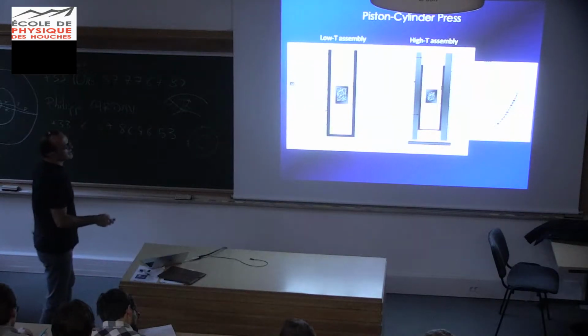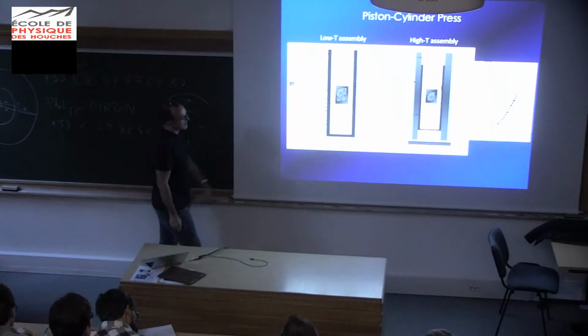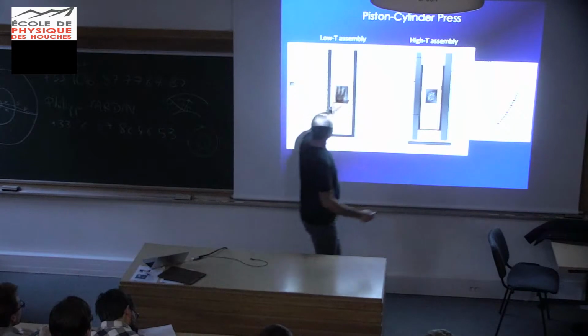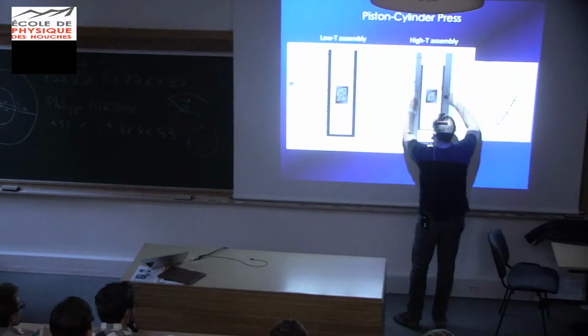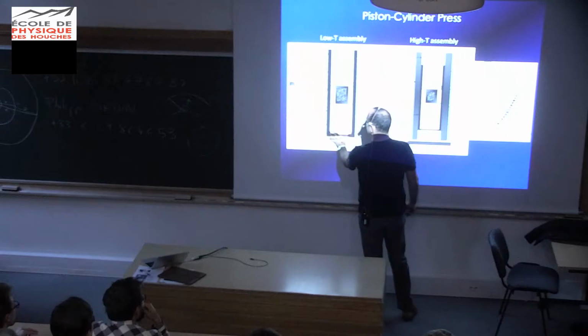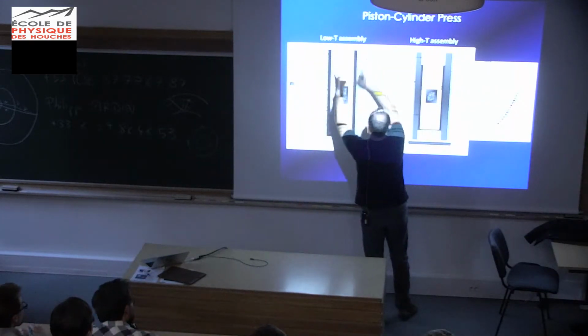So these are the two types of assemblies that you use, low temperature assemblies and high temperature assemblies. Essentially, if you look at it, it's identical. You have your sample inside its chamber here and here. It's a little smaller here, but that's because you have this extra layer here. This is a graphite furnace, so it heats up by sending current through and out.